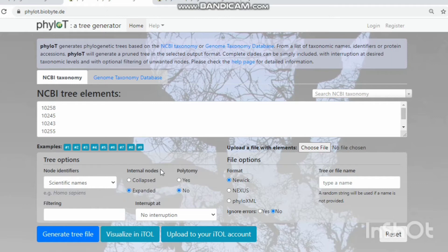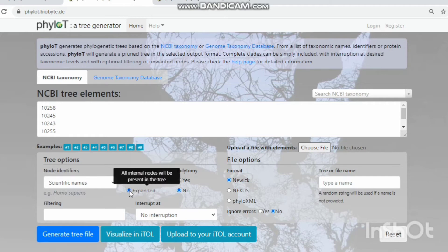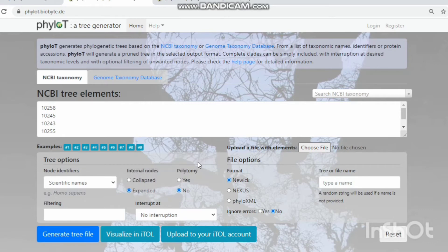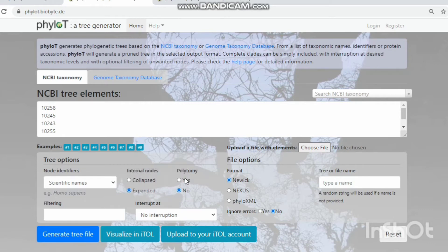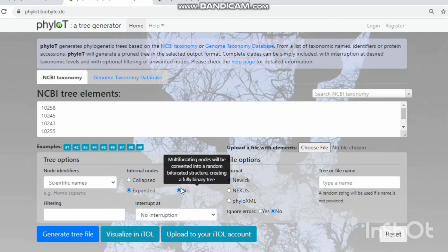The internal node option has two types: collapsed and expanded. Collapsed means only child nodes are shown, and expanded means all internal nodes will be presented in the tree. The polytomy option — yes means a multi-furcating tree will be created, and no means the multi-furcating tree is converted into a binary tree to generate the phylogenetic tree.